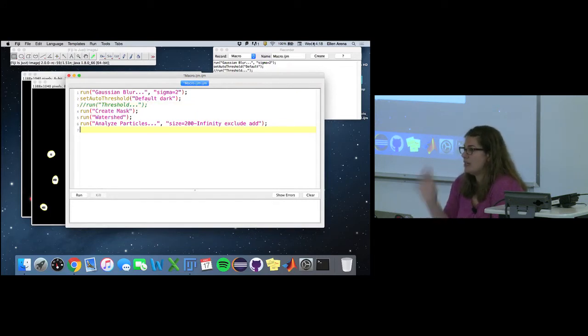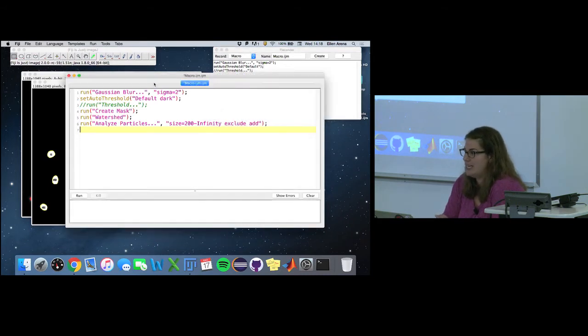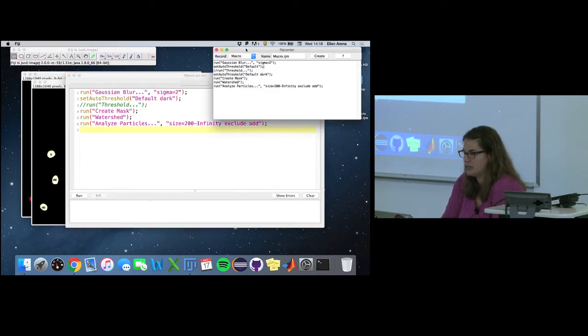From the recorder, I just have a word of caution. We hit the create button, right, to save that code and pop open the script editor. We don't advise that you necessarily copy and paste. There were issues a little while ago where some bugs were being introduced with copy and paste, which is why we now recommend clicking this create button. But obviously you can copy and paste single lines of code as you're building up a workflow. Just keep that in mind. If something's not working, double check that what's in here matches what you recorded, as far as the functions go.